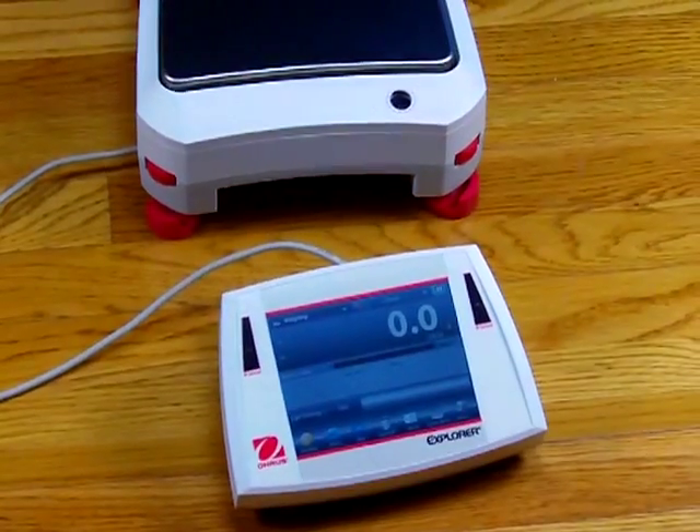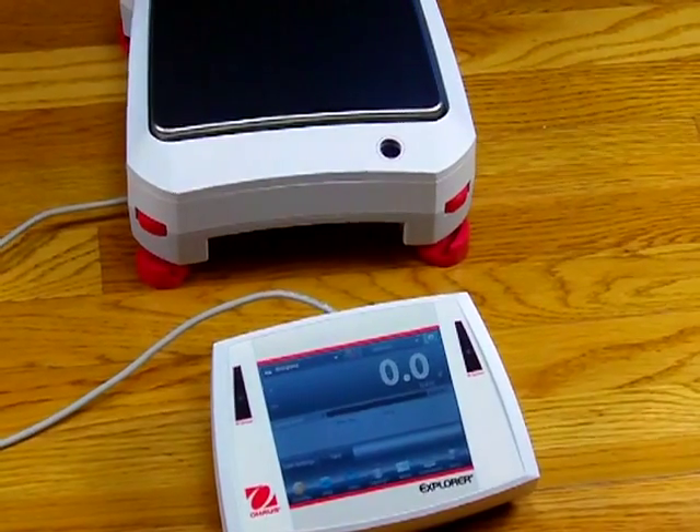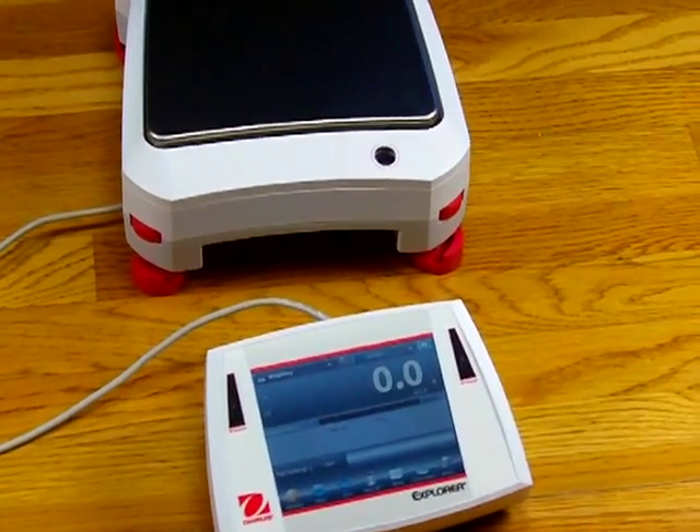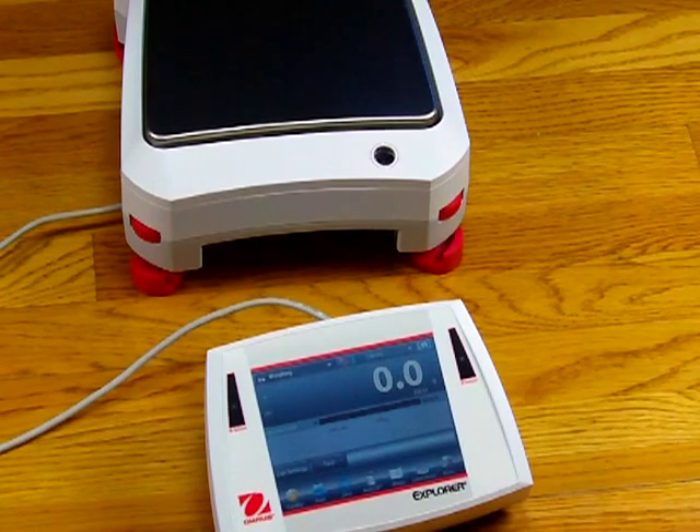The new Aarhus series are all force restoration balances — none of the models are strain gauges. The weight sensor is the critical part that actually senses the weight and gives you accurate results. Using a force restoration balance, you have minimal drift and hysteresis.